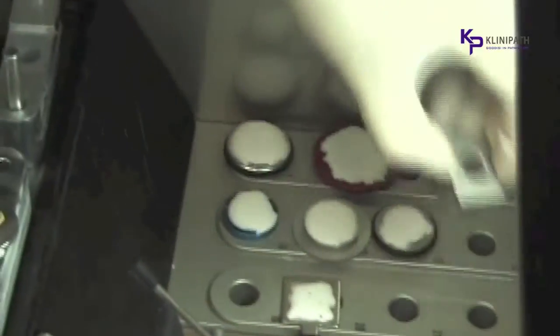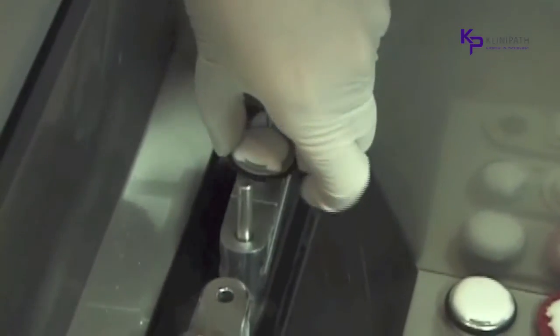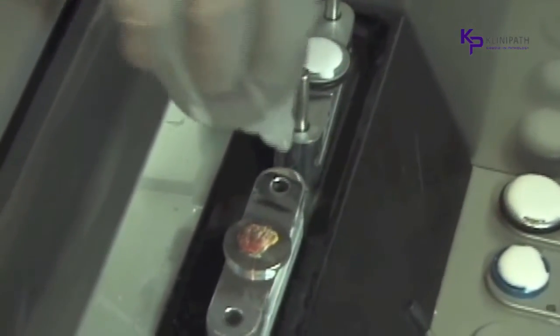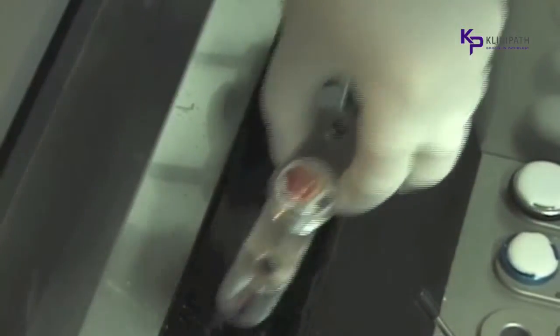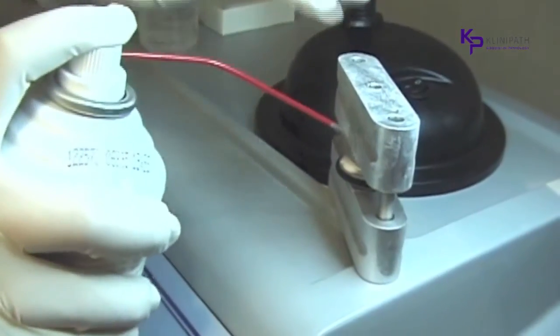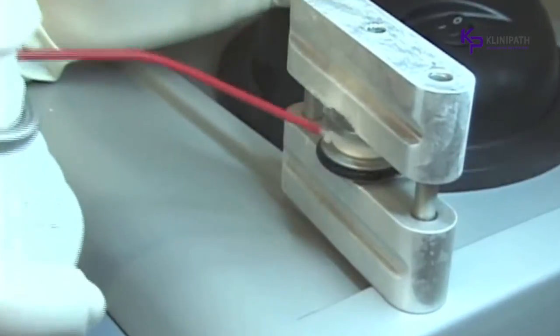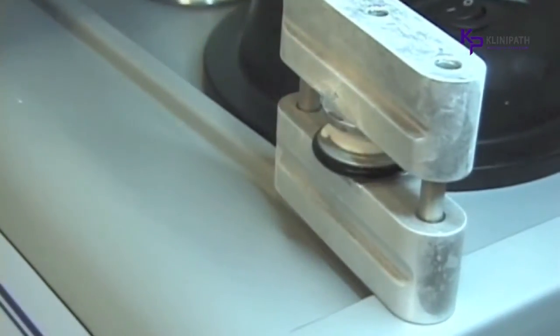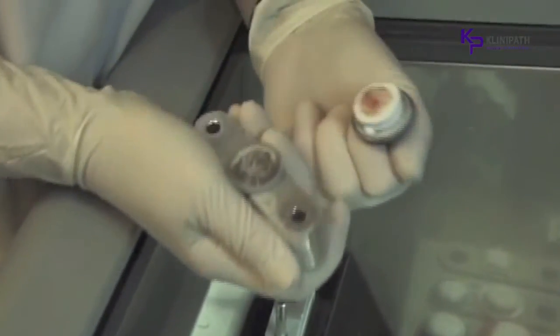This is the adapter for the Leica machine. It works with both the regular and the large Leica chucks. The Cryoembedder never needs replacement parts. The same discs are used over and over again and washed clean with water. The Cryoembedder's design is ergonomically friendly. The discs are rotated and the specimens embedded without movements of the hands that cause carpal tunnel, so common to people in this profession. The smooth disc is easily removed from the cutting chucks without the need to partially thaw or twist. They will never break or cut the technician, which can happen with glass slides.